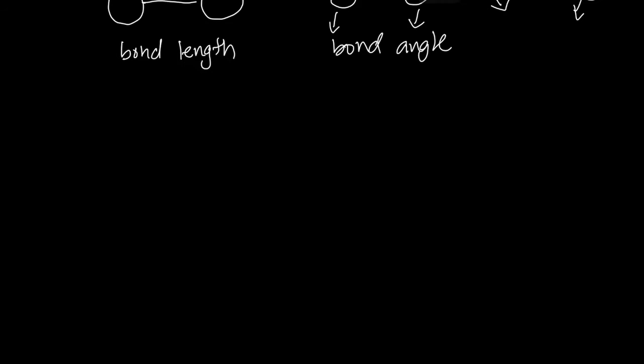For example, the O-H bond, the C=O double bond.